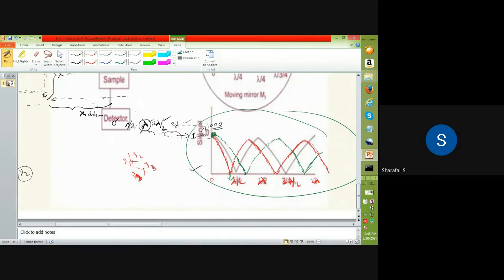For this mu2, we have minimum intensity, okay? And for this mu1, we have some intensity somewhere here. Then this mu3 also has some intensity. Add up all those intensities. So one is minimum, then two are maximum. And here also, if you consider this minimum, and this point somewhere here, it has maximum intensity. This one also has maximum intensity.